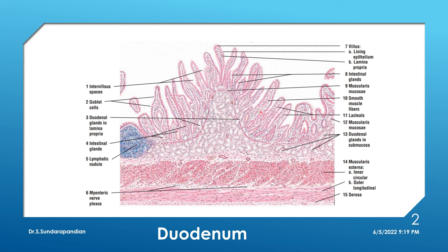So these two are the important striking features of duodenum: see for the villi, then see for Brunner's glands in the submucosa. The Brunner's glands here are extending upwards into the plica circularis. You can also make out an aggregation of lymphatic nodules, though rarely. The lamina propria contains diffusely placed lymphocytes, and sometimes we can make out a nodule.